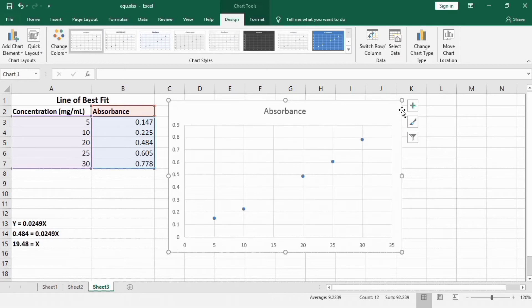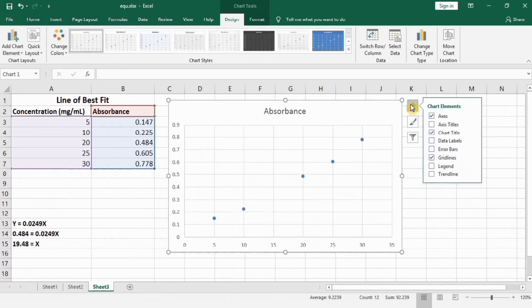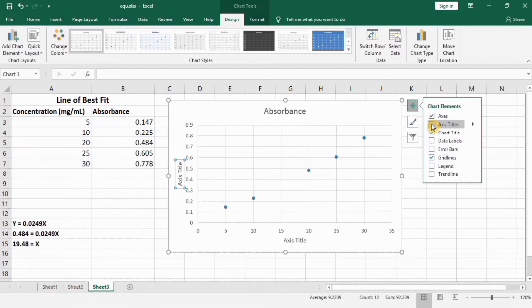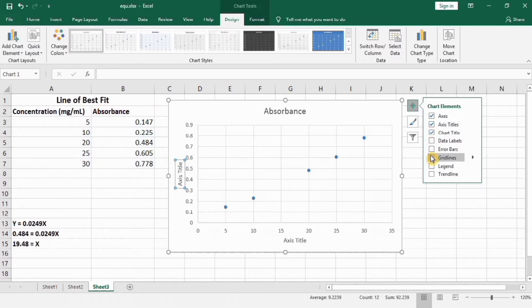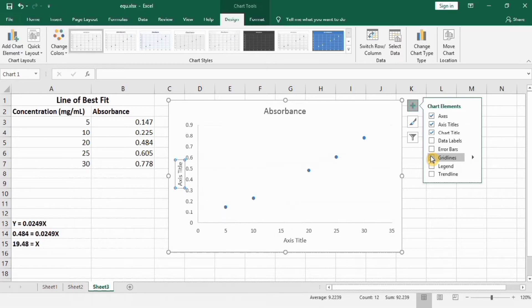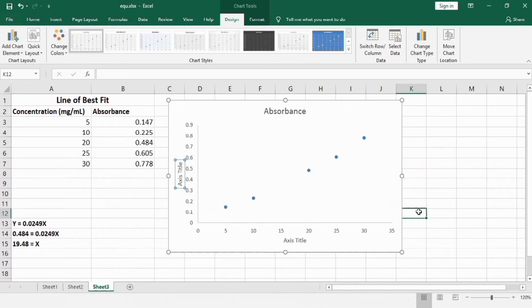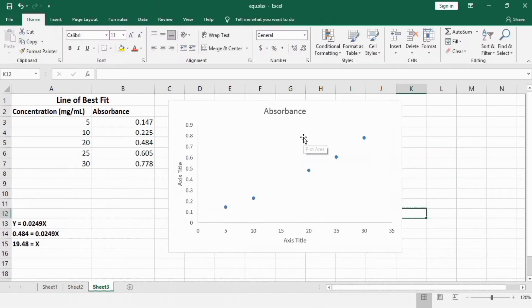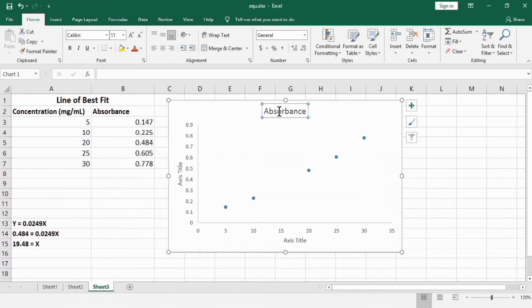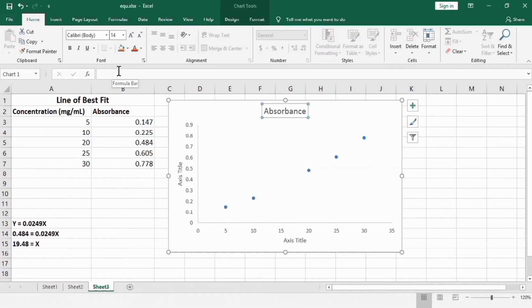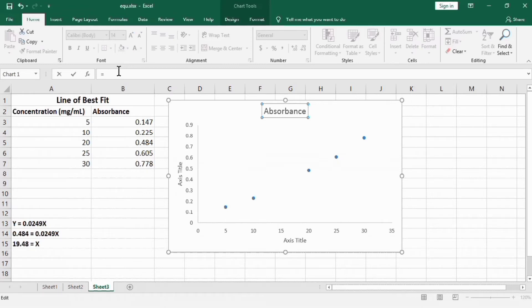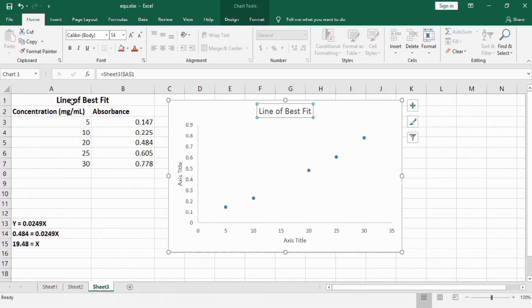Go to this plus sign and from here you can insert axis title. I want to remove grid lines so I will uncheck this option. Now if you want to change the title, select this one, put equal sign in formula bar. For example I want to write Line of Best Fit. Select this cell and click enter.